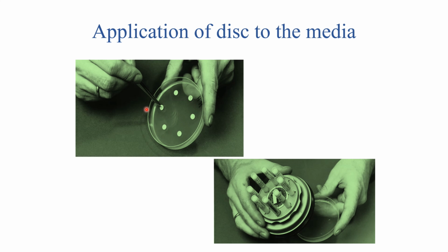We can dispense manually, or we have pre-prepared dispensers. With the help of a dispenser we place the antibiotic discs onto the Mueller-Hinton agar.